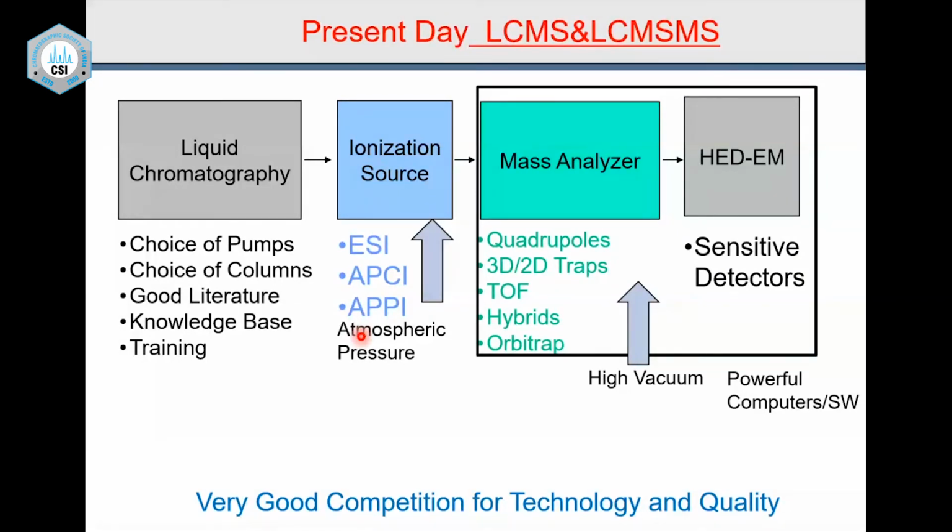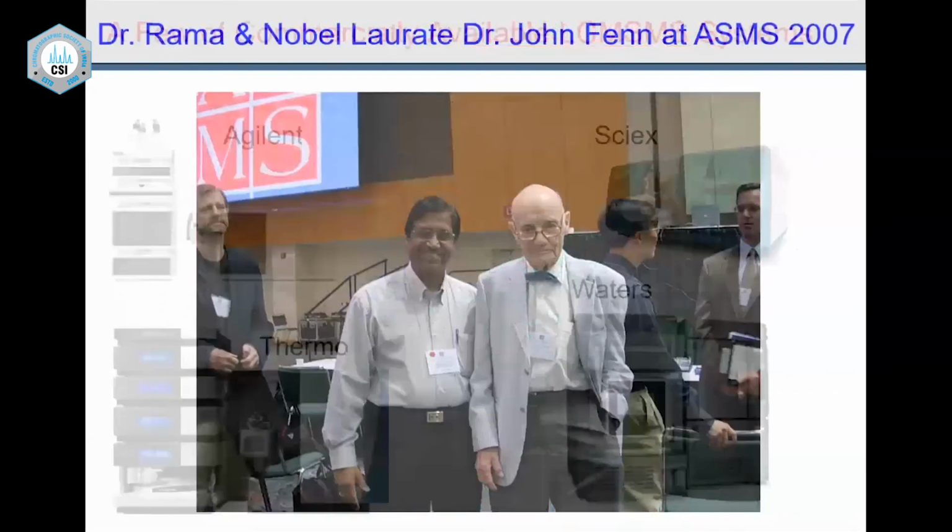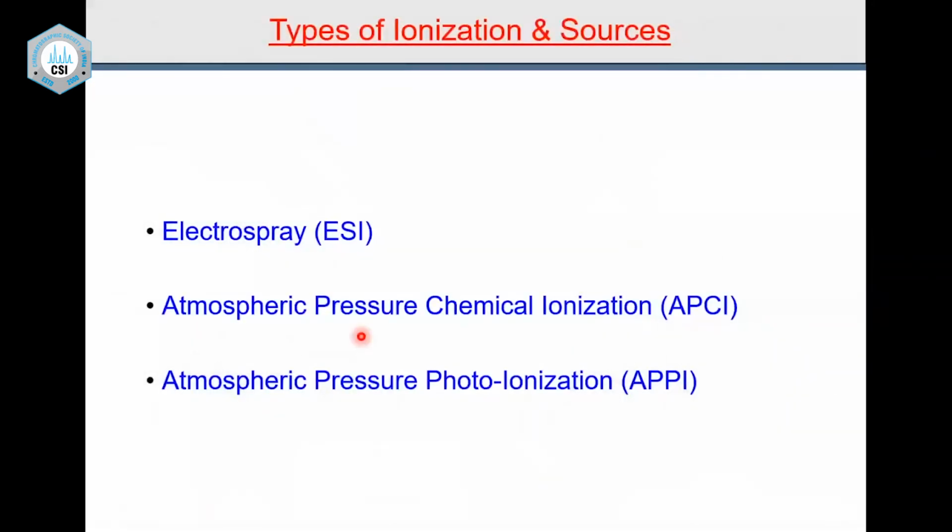Please remember that, and you can see that the session becomes very simplified for you. So today I am going to talk to you about electrospray ionization. I'm going to talk about atmospheric pressure chemical ionization and atmospheric photoionization.